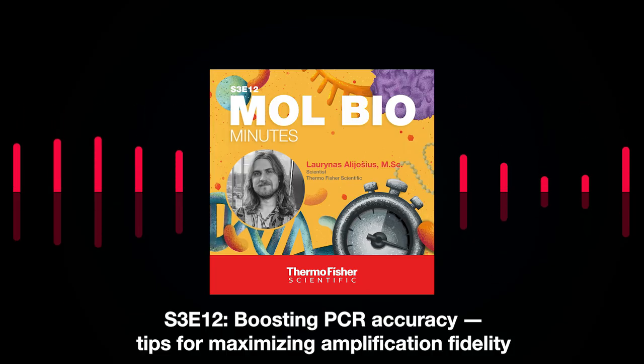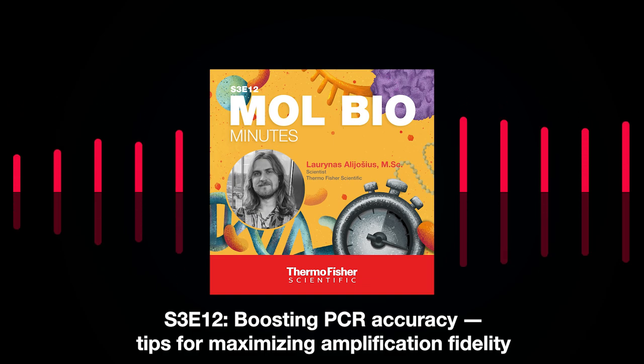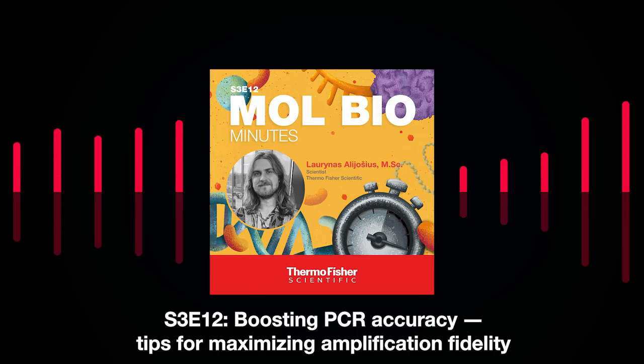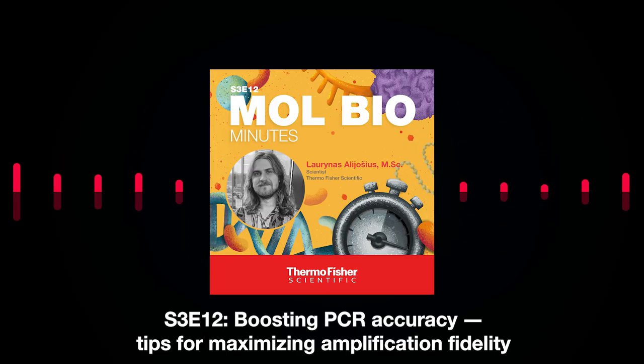But what about the roots of the accuracy of the PCR reaction? I mean, why can the PCR reaction accuracy sometimes be low, and what can cause this low accuracy? There can be several factors, so let's see what's up one by one.